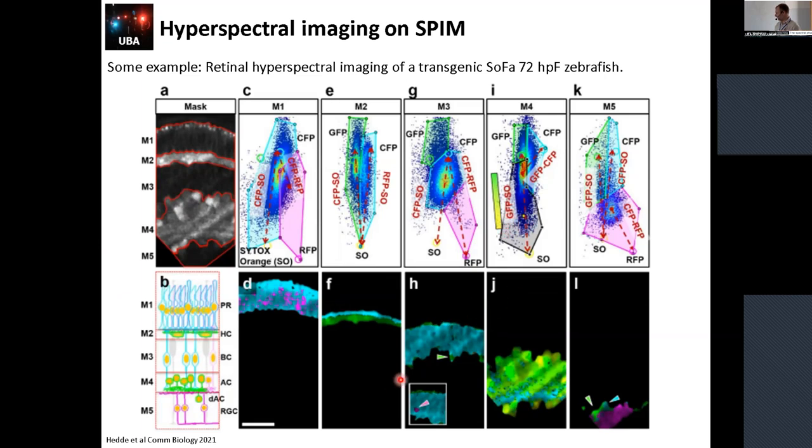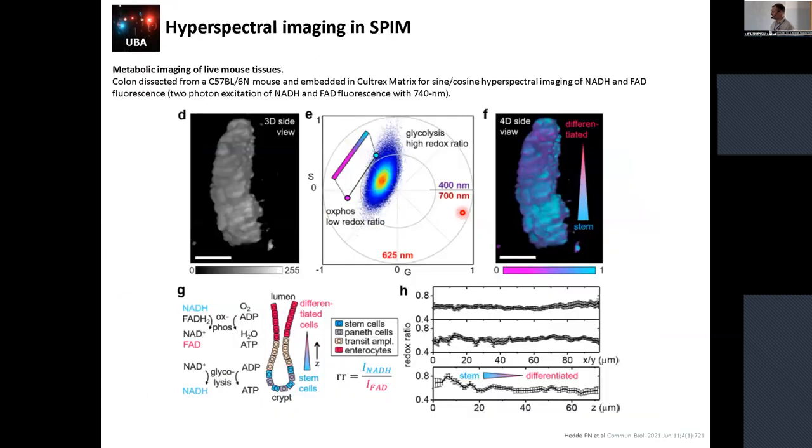And I want to highlight that here we have only one little spot, which is here in purple. These are a small number of pixels here, and the phasor captures very well that these are different locations, which is really complicated with convolution because if you have 5% of a component, you are going to lose it.